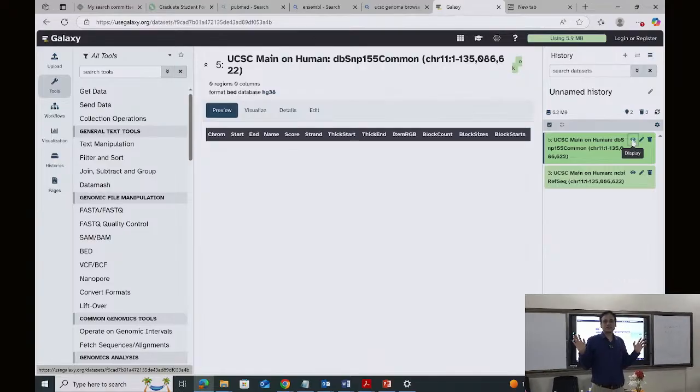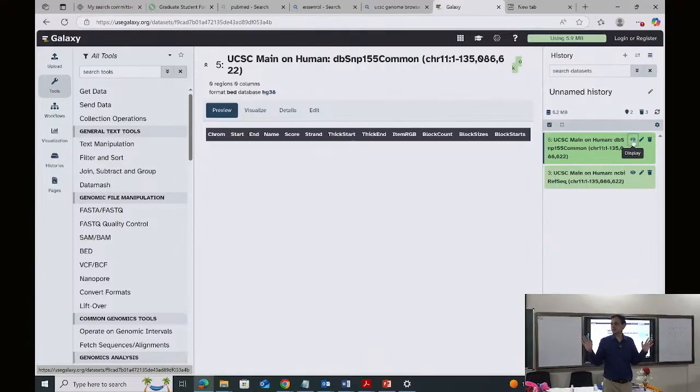It could be that server is not doing the job properly for some reason, overloaded or something, some problem with the database, because it does not provide any error code. So it is not clear why it is not giving us the list of SNPs. But we will try this in the afternoon, and we will try to figure this out.